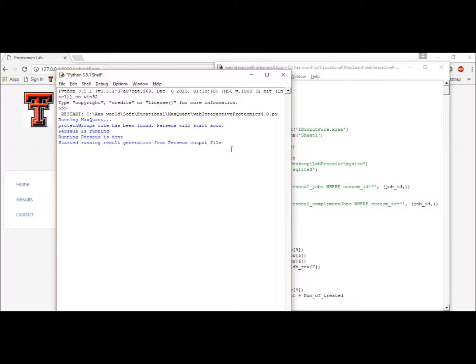This step does basically two jobs. One is to get the protein names from the FASTA file that was specified, using the GI numbers, and another one is to sort these statistically significant proteins into 4 different protein groups to be presented.